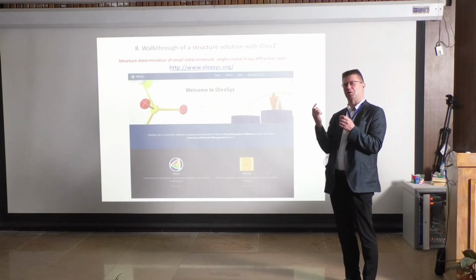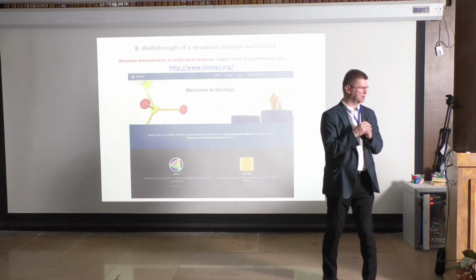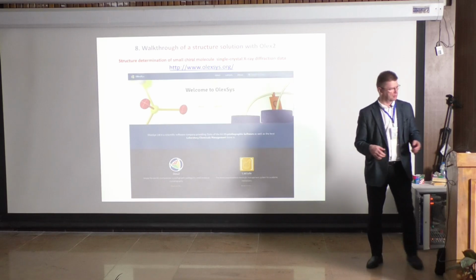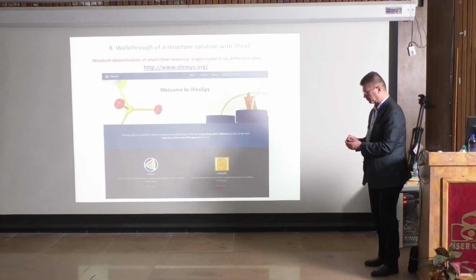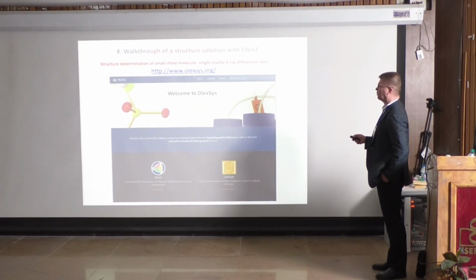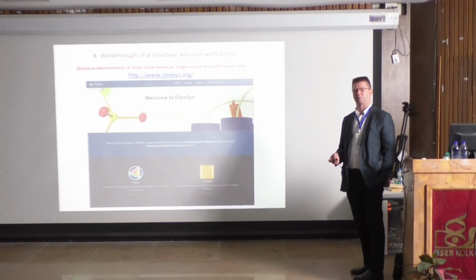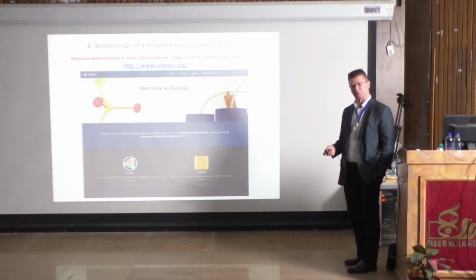And you will see later when I go through step by step what is the case. And this is really exactly how it's done in real life. So really, you can go there and we will provide these things again. We'll figure out the system, how you can get it, and then you can do it as you like.